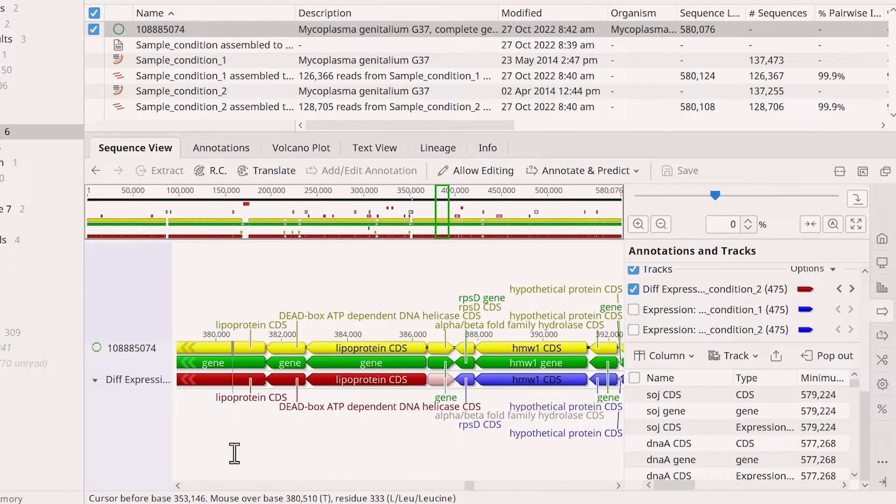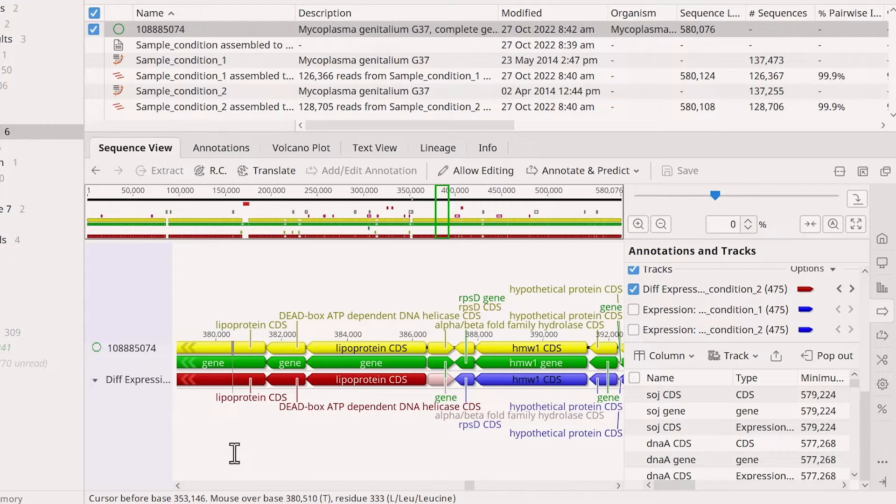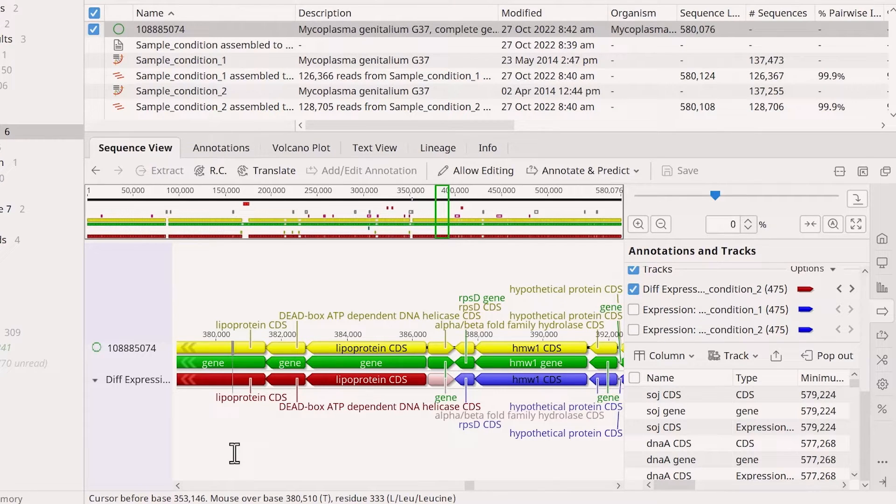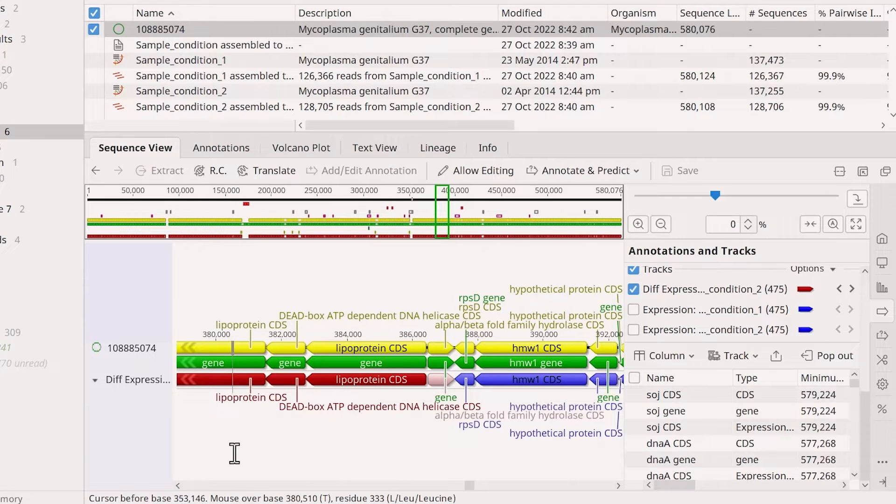The colors range from blue for underexpressed genes, white for genes that are not differentially expressed, and red for overexpressed genes.